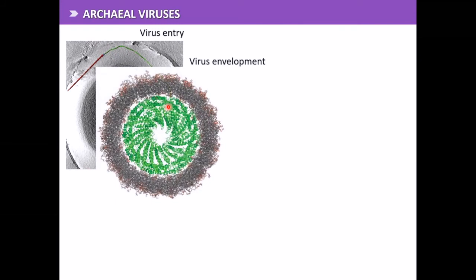Right, so thus far we have been studying these archaeal viruses and their hosts using mainly electron microscopy and electron tomography. And this means that we are looking at still images or snapshots of different time points after infection. And of course, the goal which we want to achieve is to be able to observe the infection process and different processes which happen in the cell during the infection in real time. For instance, how fast this virus moves along the pilus when it infects in a rapid process, or the envelopment of the viruses inside the cell.